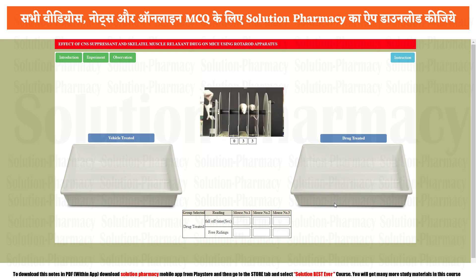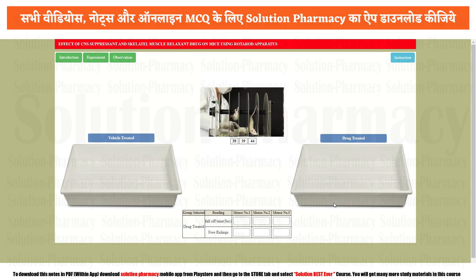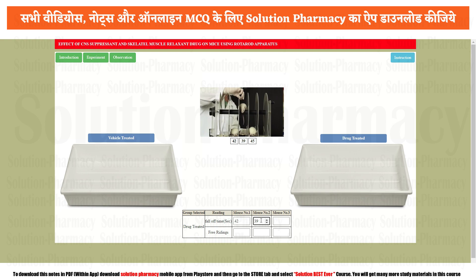The video is the same but the numbers are different — this is just for explanation purposes. Observe which rat has free riding and which is falling at what time. Observe patiently: rat one, rat two, and rat three are all moving. Rat number three is having free riding, and rat number one is also going into a free riding cycle. Rat number two falls at 39 seconds. Because we have given a muscle relaxant drug, the animals lose their grip much sooner compared to the previous group — indicating the drug has muscle relaxant activity. Rat one falls at 42 seconds and rat three falls at 45 seconds.